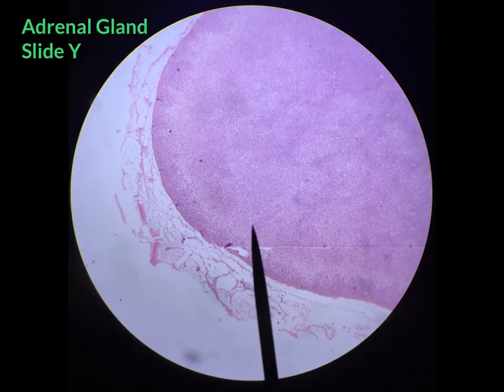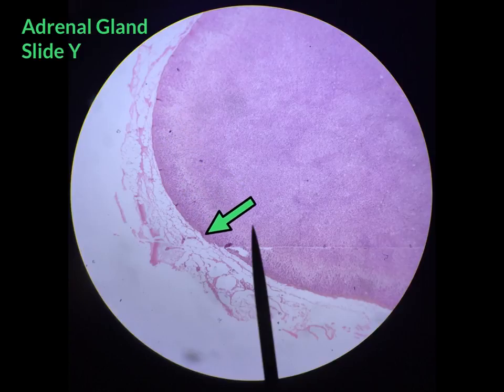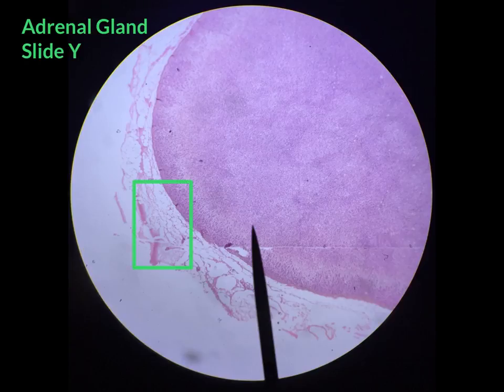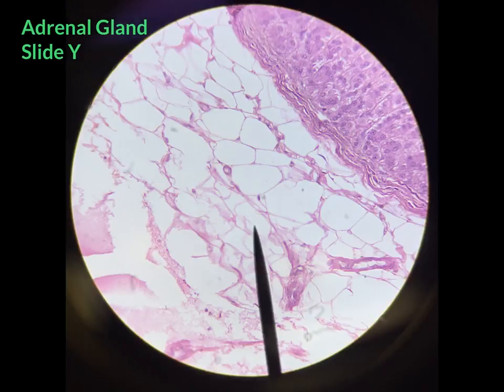When searching for adipose tissue, look on the edge of the specimen. What you're looking for is a honeycomb pattern shown here under low power. Taking a closer look at adipose tissue under high power, you can see the honeycomb pattern arrangement of the cells.